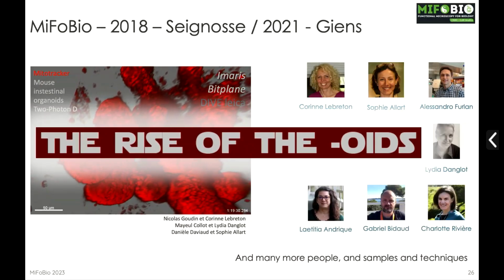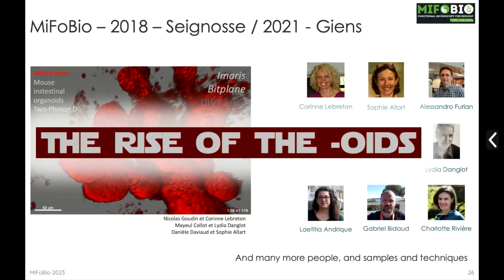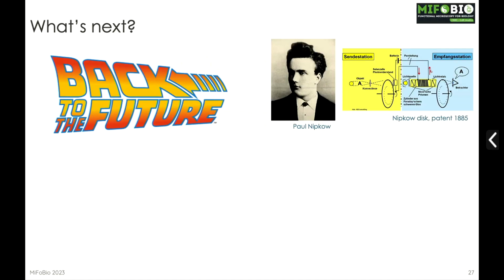And so next, usually we are supposed to talk about what's going on next, what's the future. And then maybe I will be, well, let's say provocative, but I hope not so. I would say back to the future from my perspective, but you will see. Actually, the spinning disk microscope was a little bit forgotten those years, but it has benefited from new developments in terms of light sources, the sensitivity of the cameras and so on. And so now you have many companies.